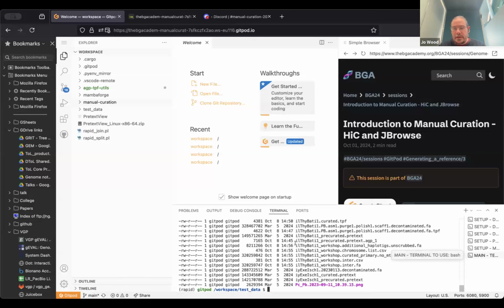And here we have our additional haplotigs file that we can then merge in with our alt assembly file to ensure that we're not actually losing sequence from the assembly, because there is value in the alt and people will use the alt. And actually nowadays people are more and more producing the 2 haplotype kind of resolved assemblies.